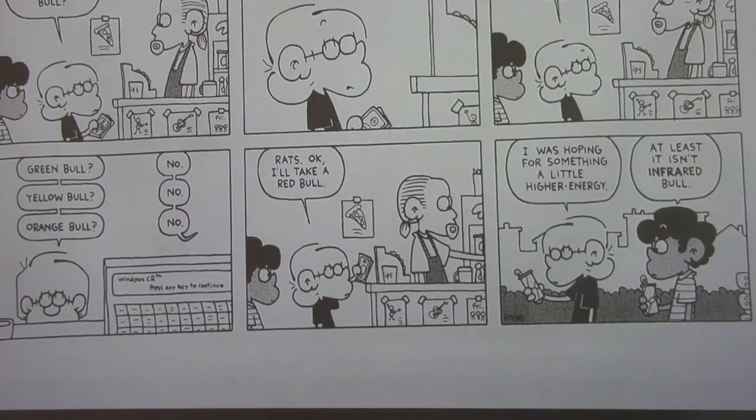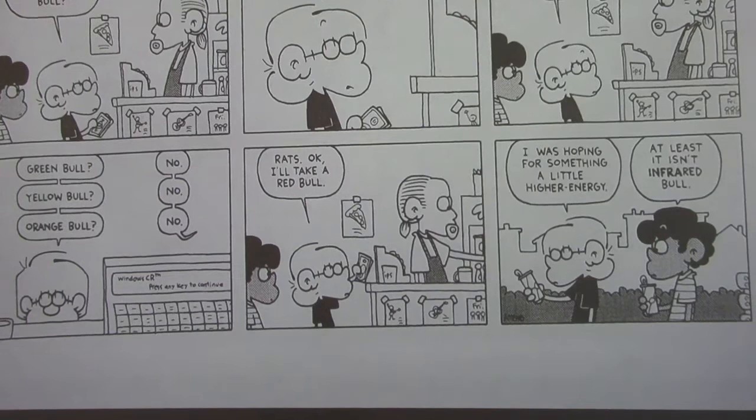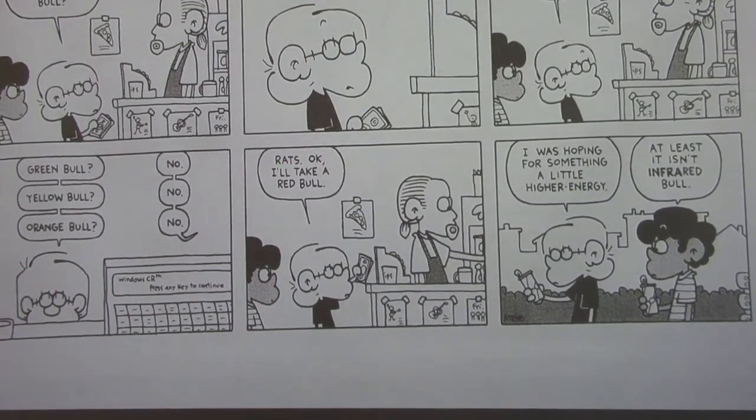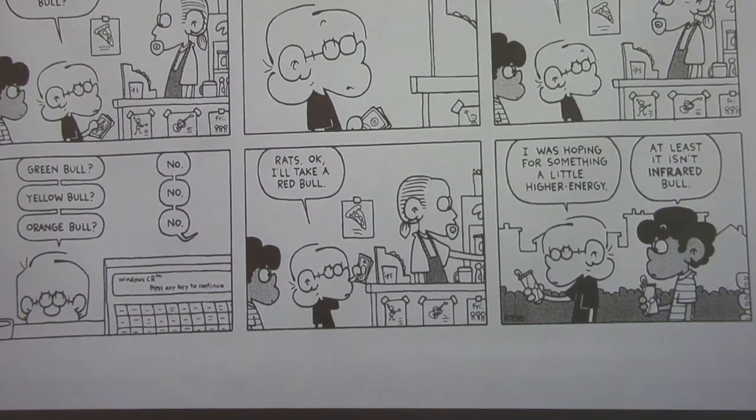All right, so today we are going to be discussing infrared, so infrared spectroscopy. Right, it's another type of spectroscopy that organic chemists use to find out a little bit of information about their molecules. And so what we use IR spectroscopy for is to find out what functional groups are present.